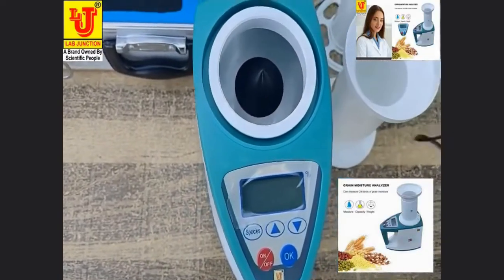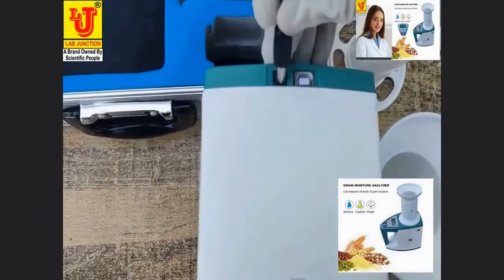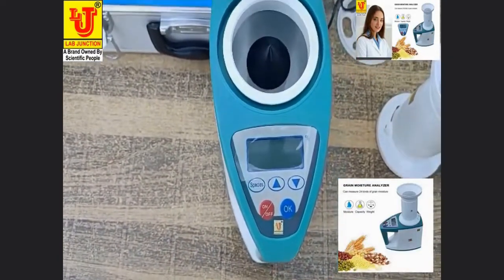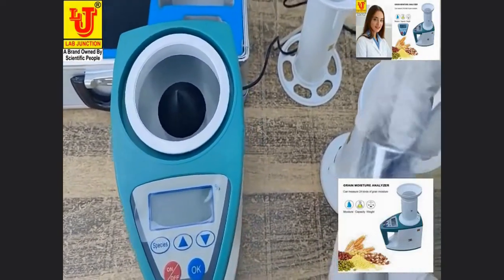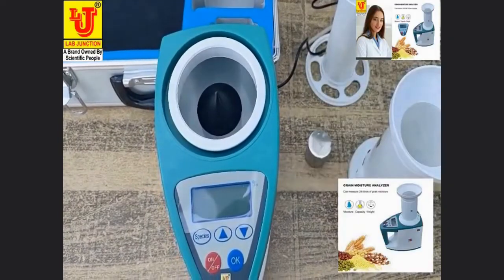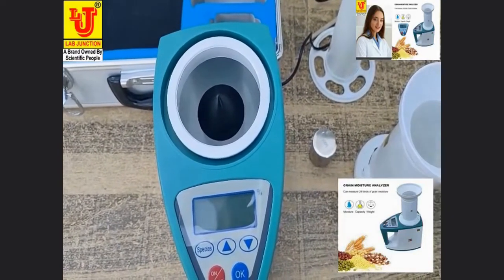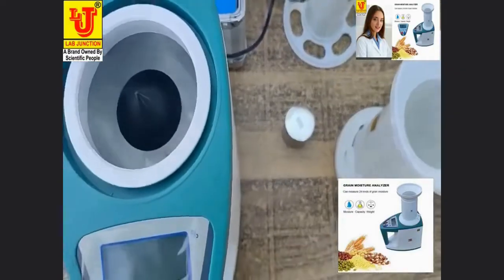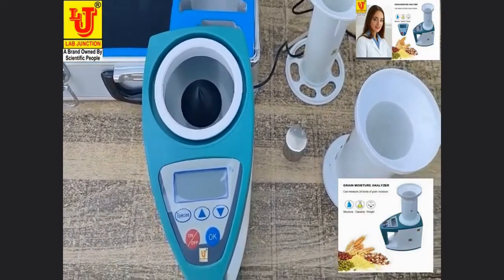Now I am connecting the power adapter to the instrument. This is the weight of 200 grams, used for calibration. This product adopts the principle of variable frequency capacitive measurement to detect grain, and is mainly suitable for inspection and measurement of grain purchase and storage.